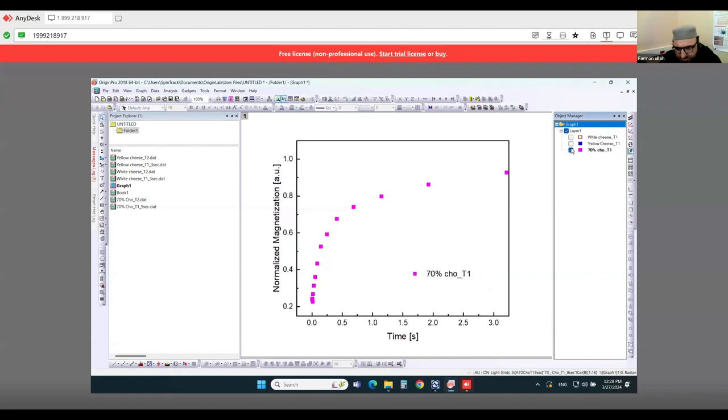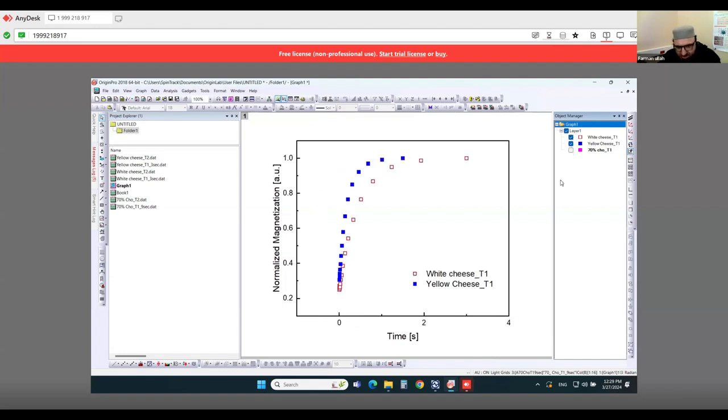One more thing, I told you that because I use a different scale for the samples, the two of them were nearly compared to one another. But because each sample has different time observations, we must take one by one.